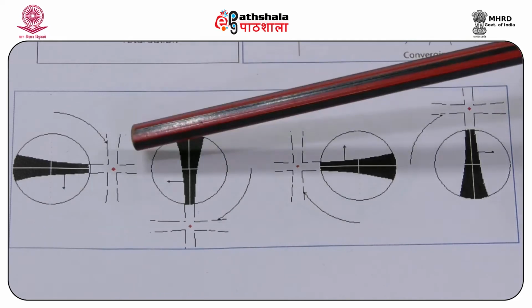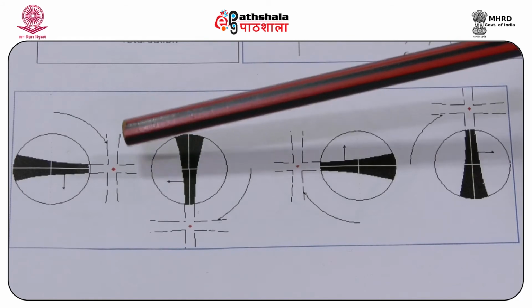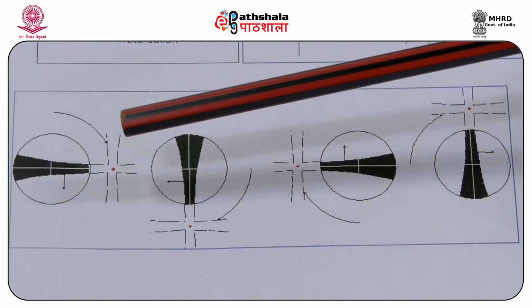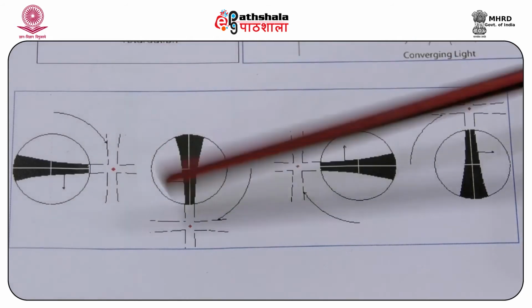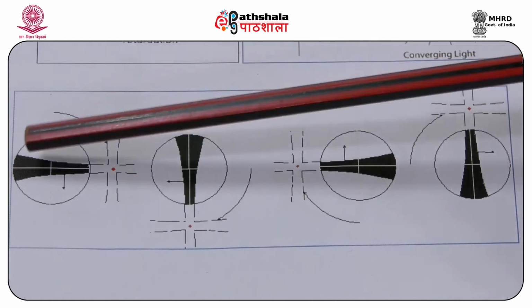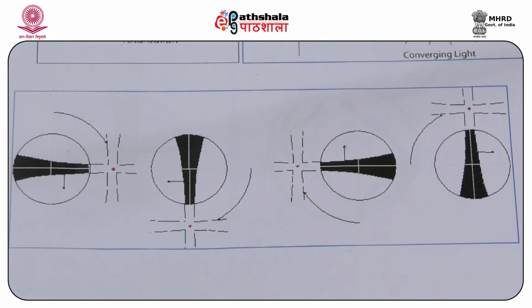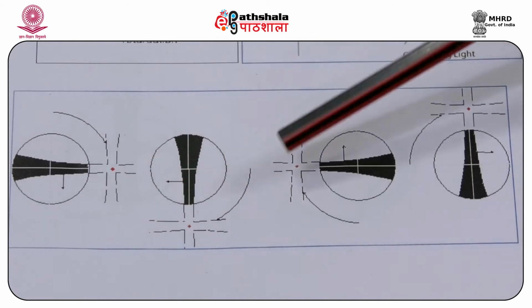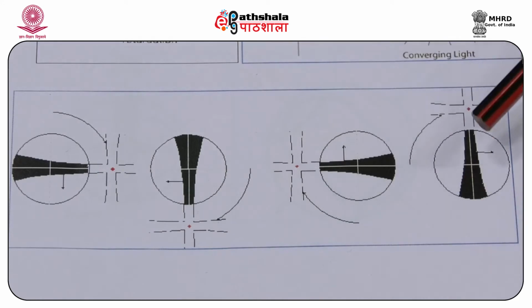If the melatope is well outside the field of view of the microscope, the isogyres sweep across the field of view in sequence as the stage is rotated, with the isogyre always remaining parallel either to the east-west crosshair or to the north-south crosshair. By noting the direction, as you can see here, it is rotating in the clockwise direction, here clockwise, here we have the isogyre moving in the anti-clockwise direction.